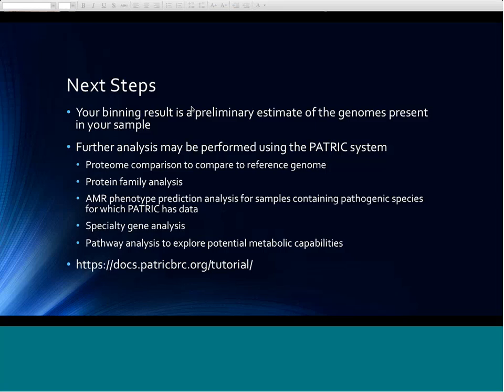I don't know that it would be something that would preclude us, but we would need to check with the program and see if that's something that would be under the scope of PATRIC. I guess the issue is the P in PATRIC stands for pathogen, and so we would need eukaryotic pathogens before it would be considered within PATRIC's remit. Isn't that correct? Well, you've got the host.